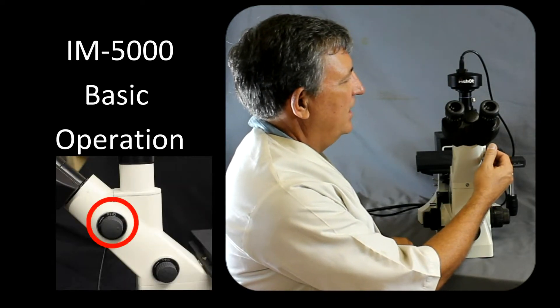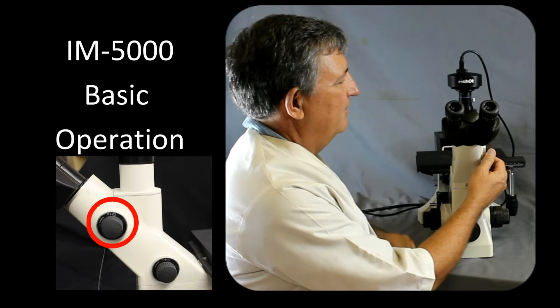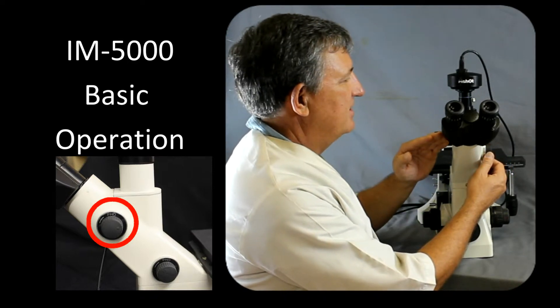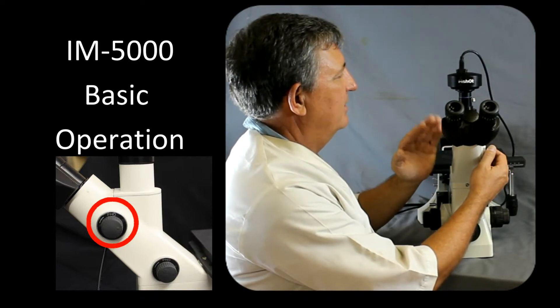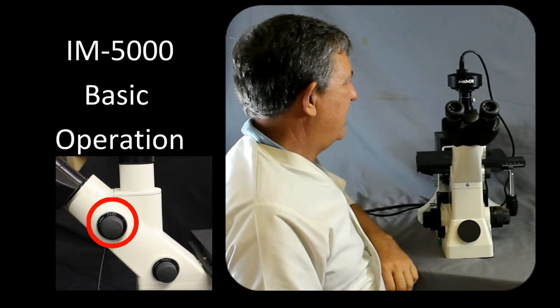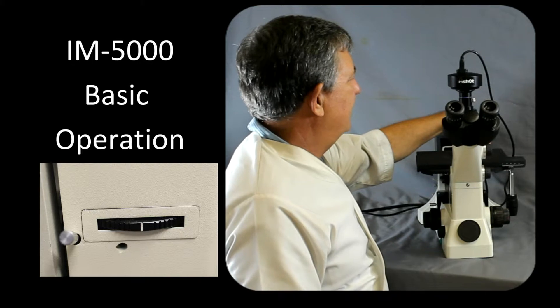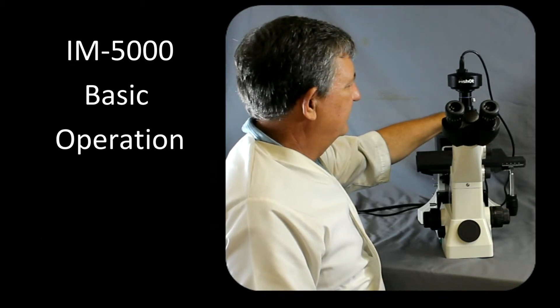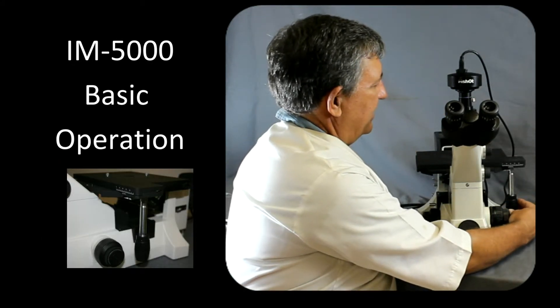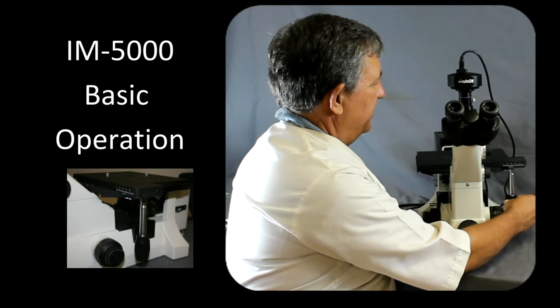This knob here will change the light path from 100% to the eyepieces to 80% to the eyepieces and 20% to the camera. There's also a number of filters that can be added on a turret in the back here. And we also have an XY control of our stage.